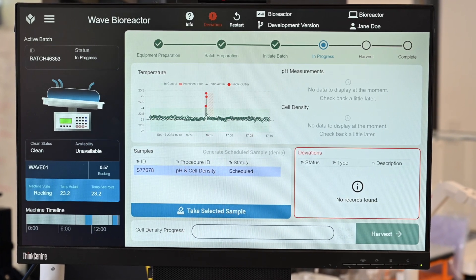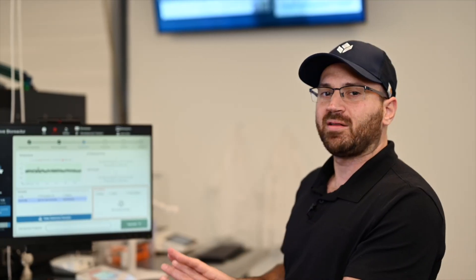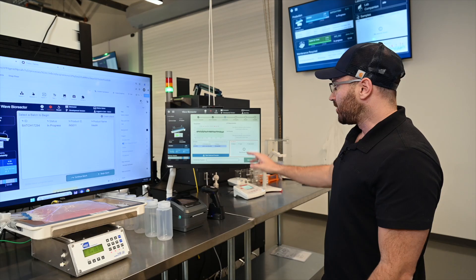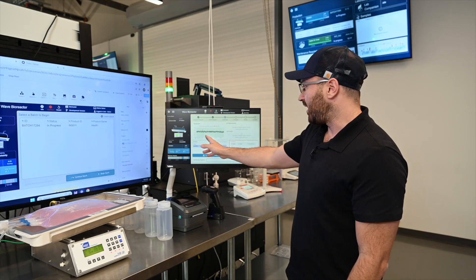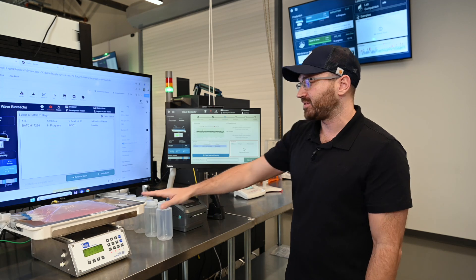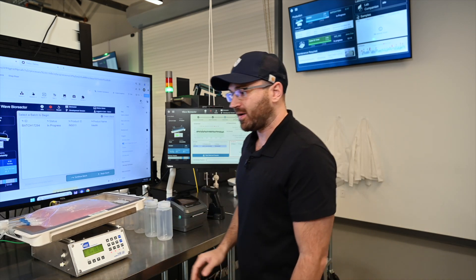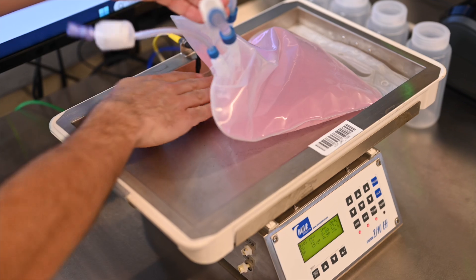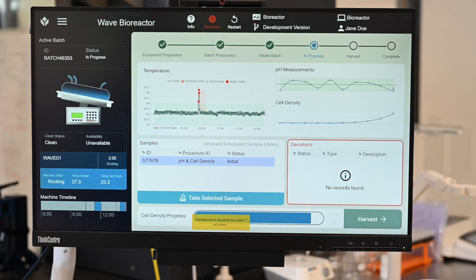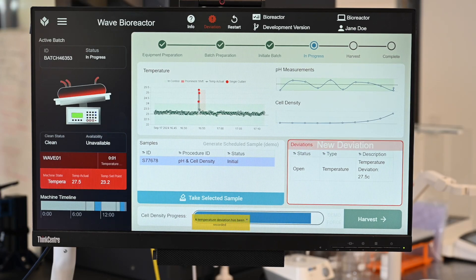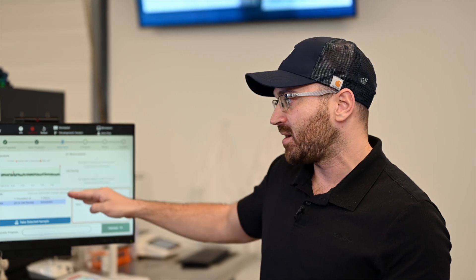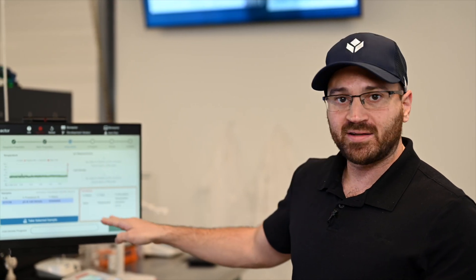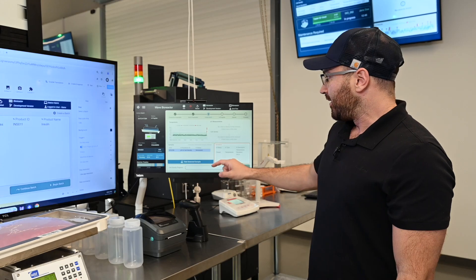This is an interesting screen because this is a screen that will likely be running at all times at the bioreactor. What you see here on the top left is a temperature monitor of what's happening in the bioreactor. So if I were to put my hand on the temperature sensor, it should spike the temperature and create a deviation. This temperature will be displayed on the screen and it will start coming back down into range. And when that comes down into range, it'll close out that deviation for approval later on.